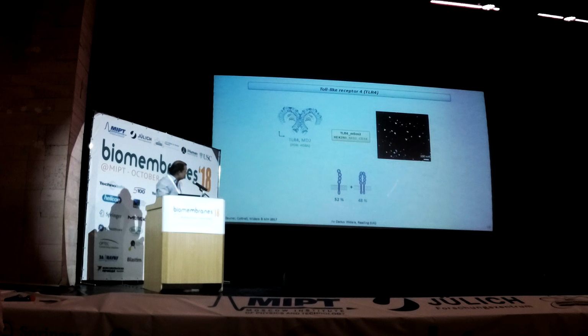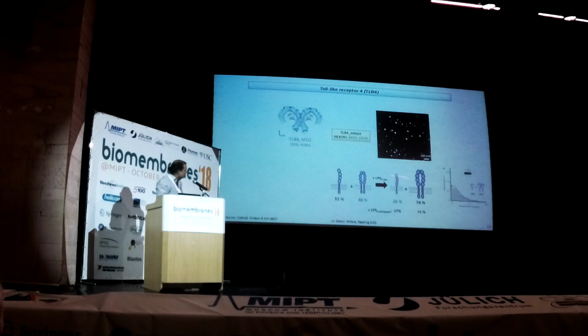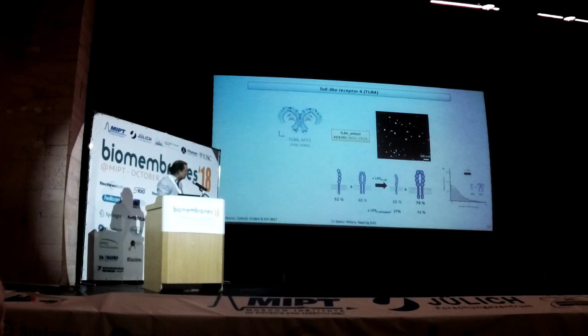And we started with our resting cell, and we added 3 different species. The one species were derived either from E. coli and the other one from Salmonella, and both showed that it drives the receptor towards more dimers. And it's apparently those dimers which bind to the downstream signaling proteins and start NF-kappa B signaling. The third species we used was Rhodobacter. Rhodobacter LPS turns the whole receptor monomeric. No dimer at all, so it's very antagonistic.